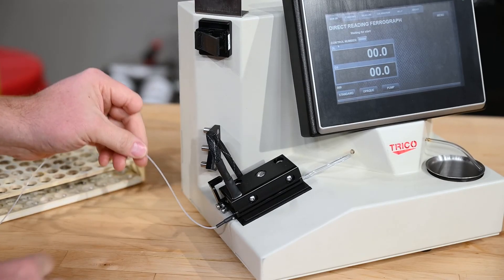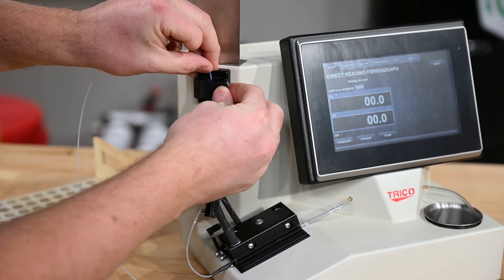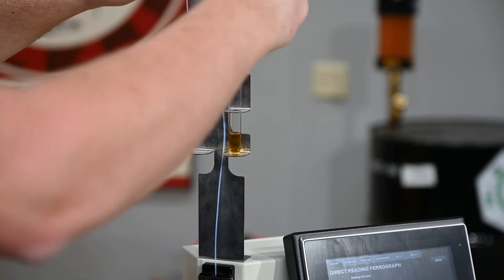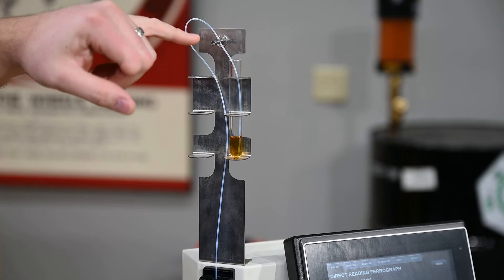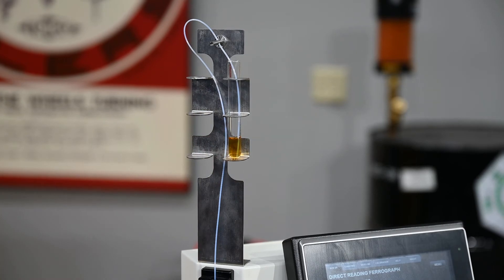Next we take the tube, run it through the tube holder, then through the end of oil sensor — not crimping the tube when you close the door — then up the vial holder into the vial. Then use the spring on the vial holder to hold the tube in place so it is on the bottom of the vial at the end of the oil sample.